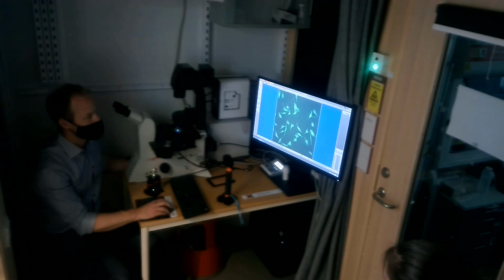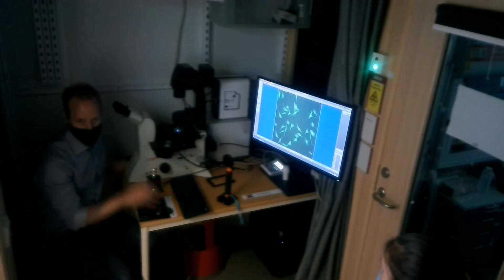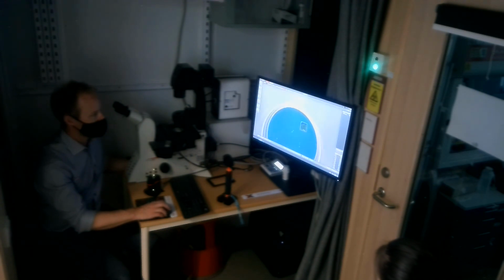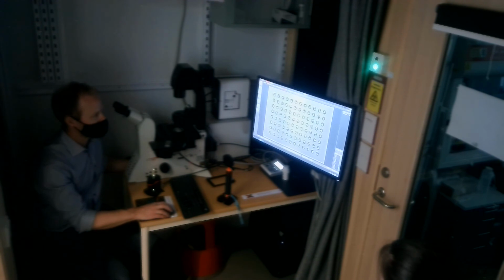It has been getting better since Navigator was first released. So now I'm starting to do more here, but previously, when I tweaked my settings for each channel, I used to go back in the default interface, which is absolutely possible because everything travels. So you see everything that I've done now. You have all of this. I can click on this one to see my full thing.